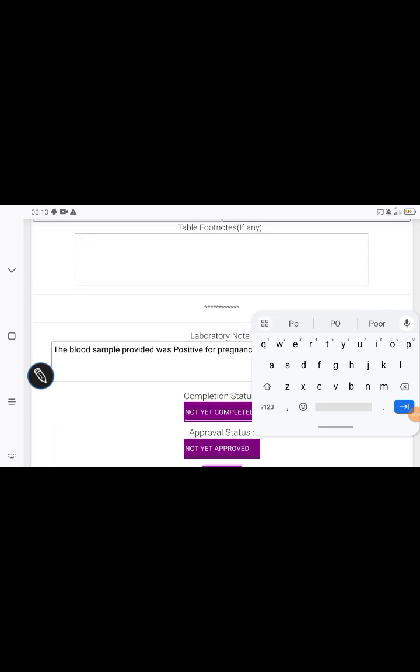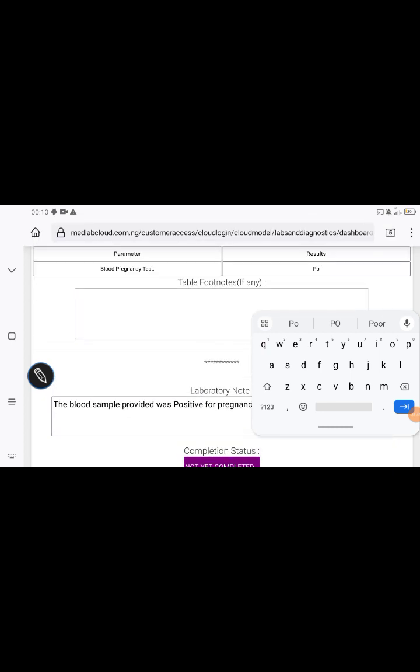All the tests they do are just inside one folder, and then they keep editing. If this person comes and does his own, they save on top of somebody else's. There is no control. After a month, you can't actually give a physical record. There's no data mining, you don't keep data for future use, no statistics. They are just typing and saving. And when another person comes to do the test, they open that test and write a new one on top of it. Those are unethical behaviors, and there has been no solution until now. Well, our software is the solution for that.